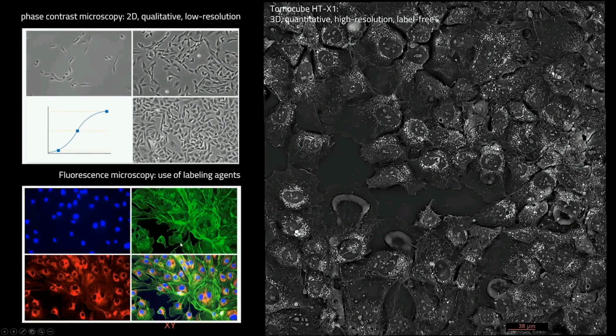If you use fluorescence, it can provide strong molecular specificity, but you have to worry about phototoxicity and photobleaching issues, as I mentioned. And also the number of labeling dyes is limited because of the experimental complexity, as well as the light efficiency becomes low if you have more than 3 to 4 fluorophores.